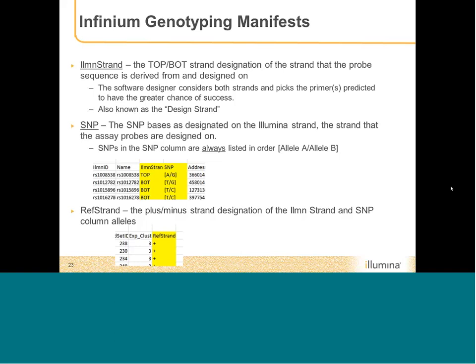So we design on either top or bottom strand. So this Illumina Strand column will tell us which one, the top or the bot, it was designed on.